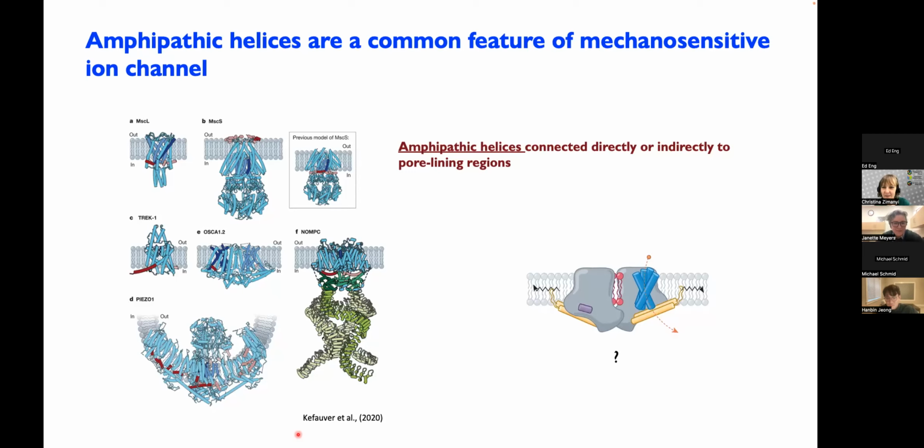Let's see. Here's one. Nice talk. Have you tried other methodologies besides amylamine to solve the particle orientation issue? It seemed to me like that was the first thing you tried and it just kind of worked, but if that's not correct, let us know. Yeah, actually I tried others, like using graphene grids. It is also known that applying magnesium acetate on the grid changes the feature of the carbon membrane, but yeah, it did not work for me.